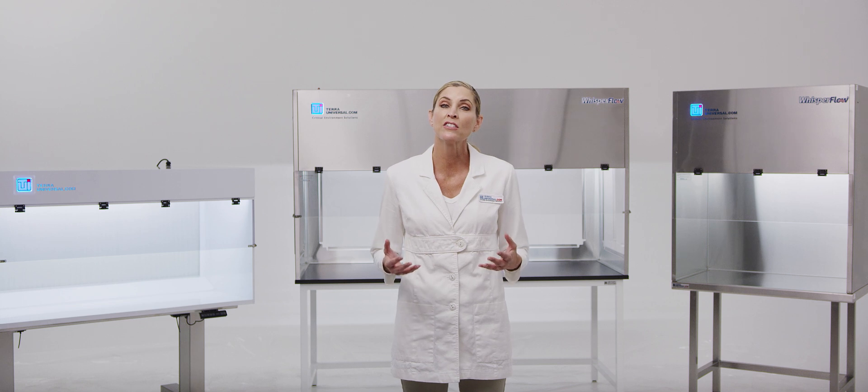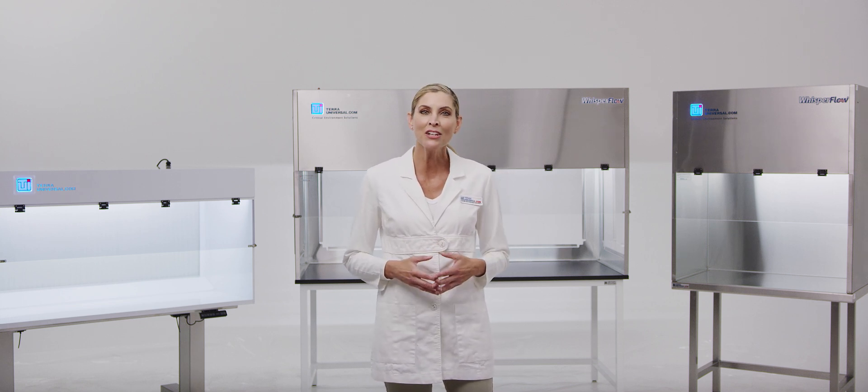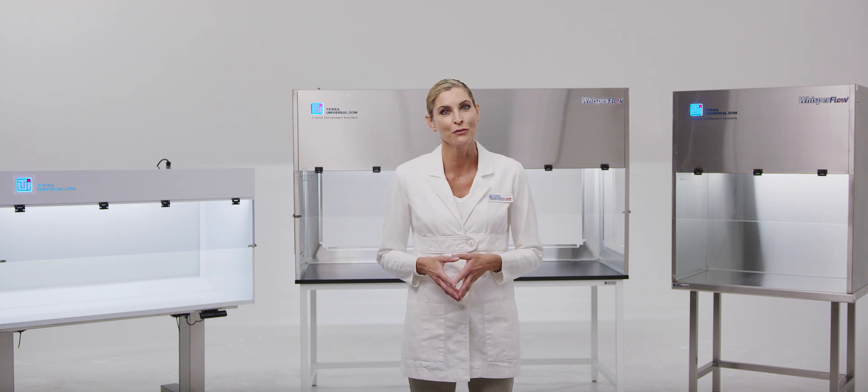Tara manufactures and stocks all standard hood and FFU designs for immediate shipment from our main facility in Fullerton, California.